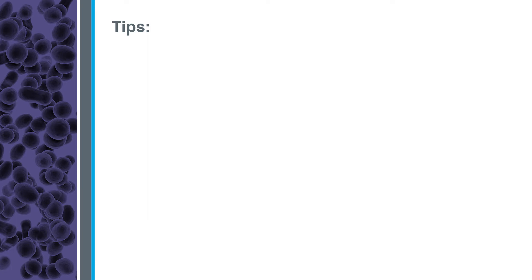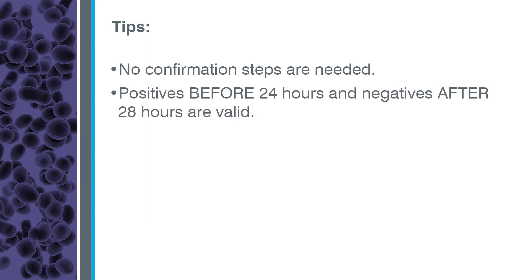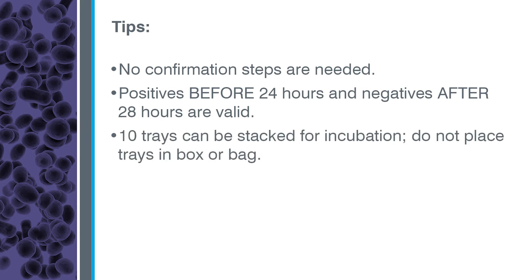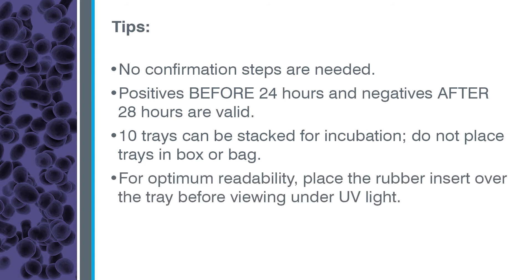Keep these tips in mind. No confirmation steps are needed. Positives before 24 hours and negatives after 28 hours are also valid. Up to 10 trays can be stacked for incubation. Do not place trays in a box or a bag. For optimum readability, place the rubber insert over the tray before viewing under UV light.